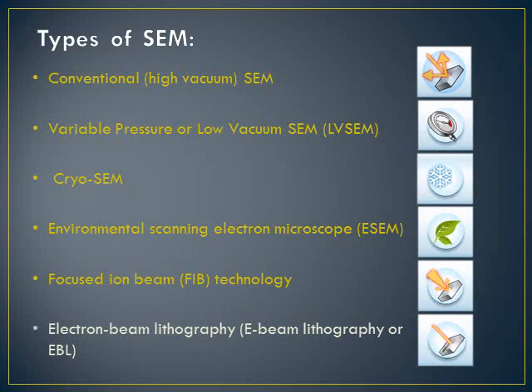And at last, there is electron beam lithography. EBL is a maskless lithography technique used for patterning of computer-generated layout structures on photoresist on Si wafers. To date, EBL remains the highest resolution patterning tool in lithography. It is widely used in photomask fabrication and low volume production of semiconductor components.